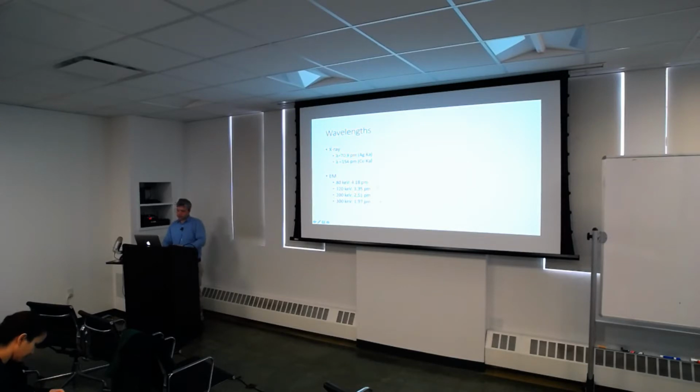So EM is definitely not wavelength limited for any sort of diffraction. You don't even need a very powerful electron microscope to get very tiny wavelengths. The difference between 80 kV and 300 kV is not a big difference. What you do need is a good source. So you still need a decent microscope, but you don't need high voltage.